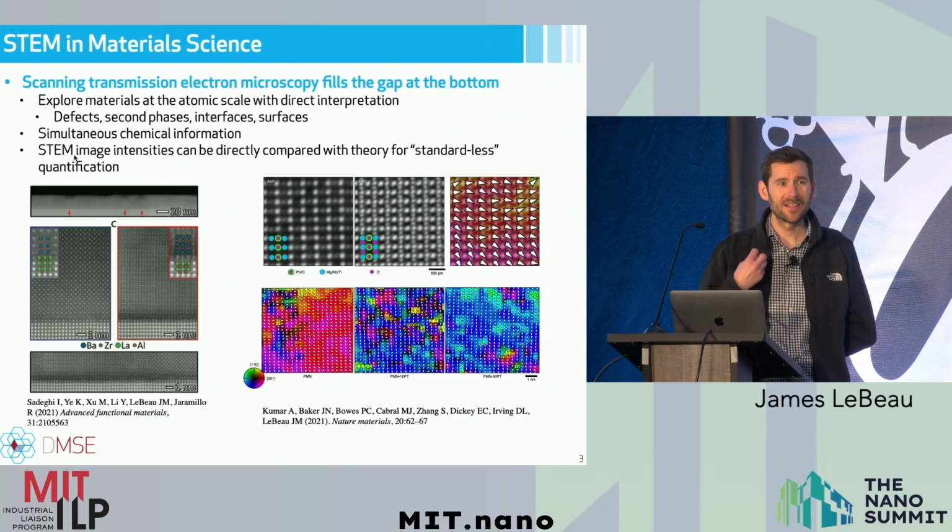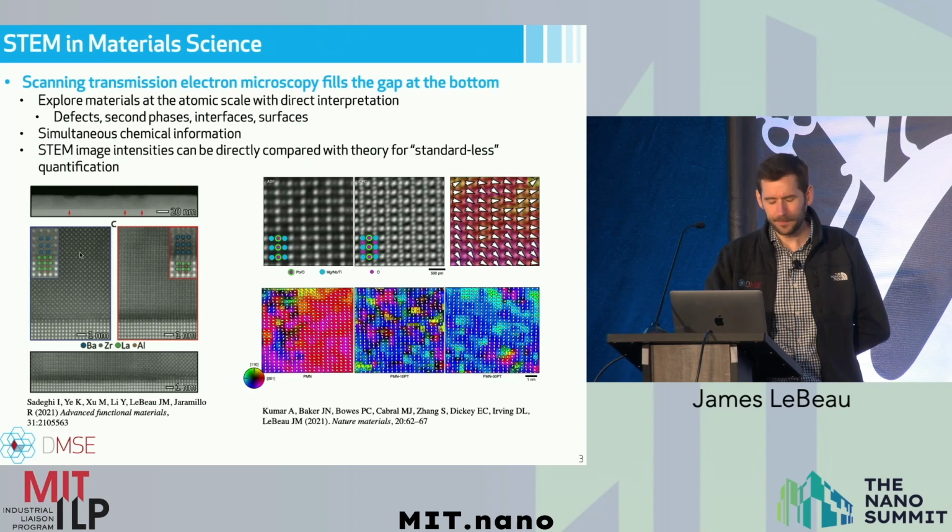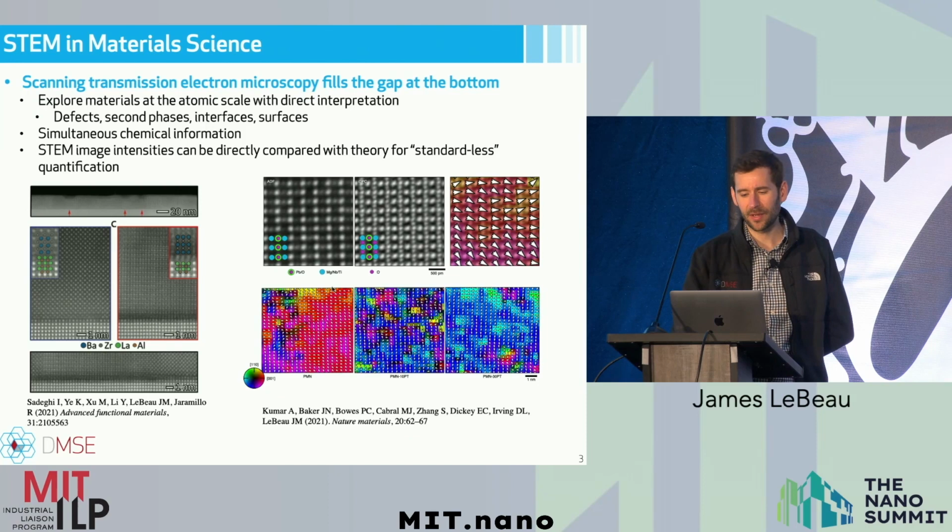This is some work with collaboration between my group and Jaramillo's group, looking at these chalcogenide interfaces with oxides, and understanding how those materials grow is directly revealed through these techniques. We can also do things like measure polarization on a unit cell by unit cell basis in these materials to give great insight into ferroelectricity, for example, or functional behavior of materials as a function of composition.